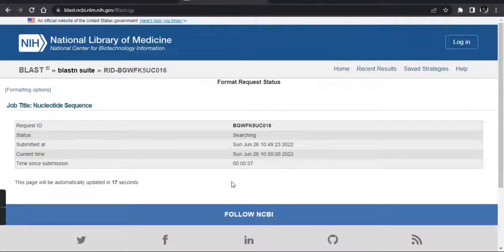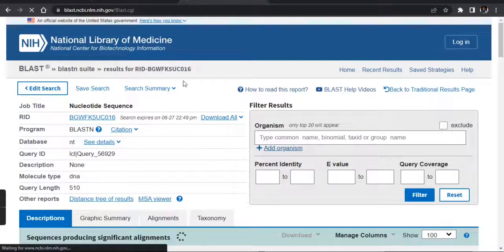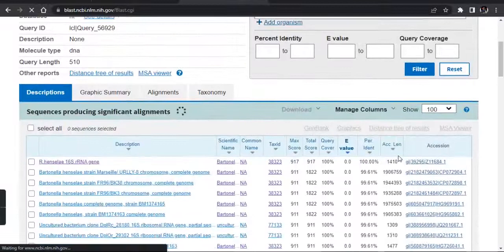So we are still waiting for the results. Okay, here is the BLAST search result.